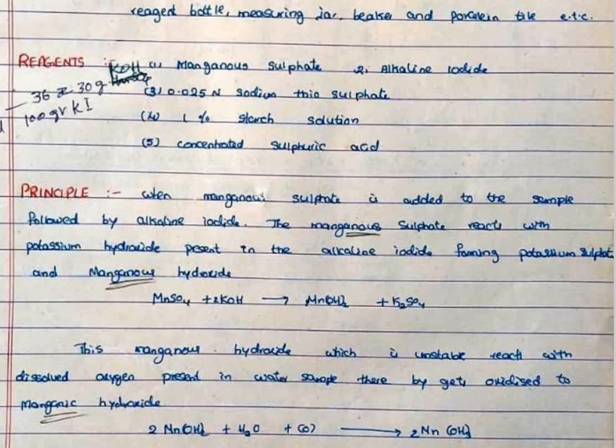Reagents are manganese sulfate, alkaline iodide, 0.025 N sodium thiosulfate (hypo), 1% starch solution and concentrated sulfuric acid.